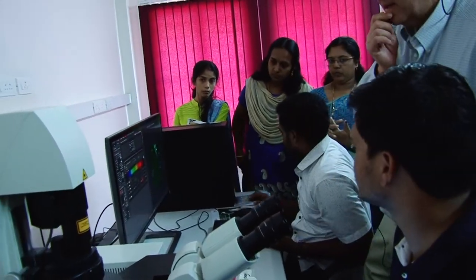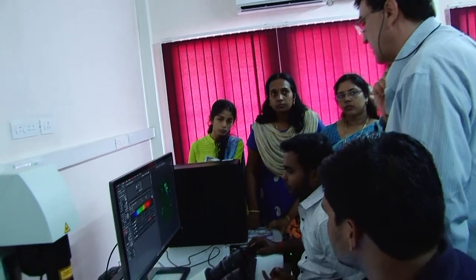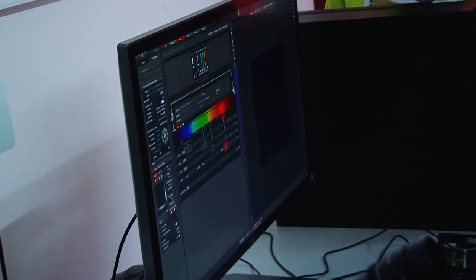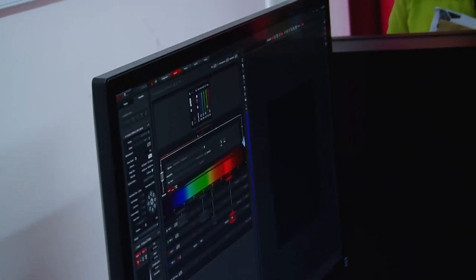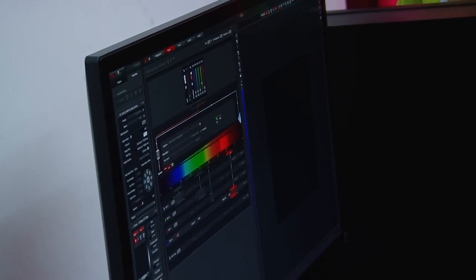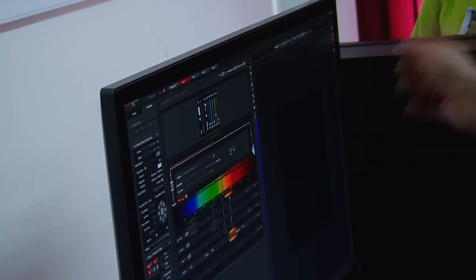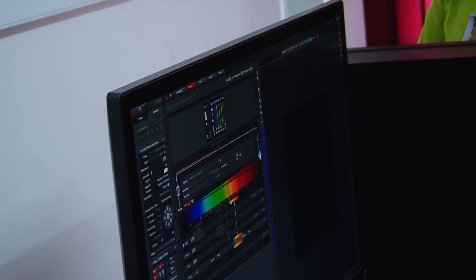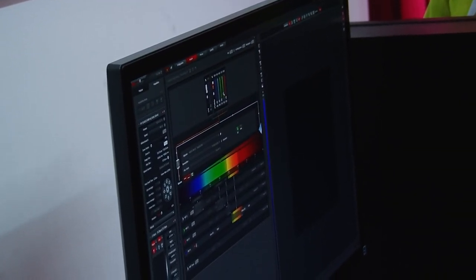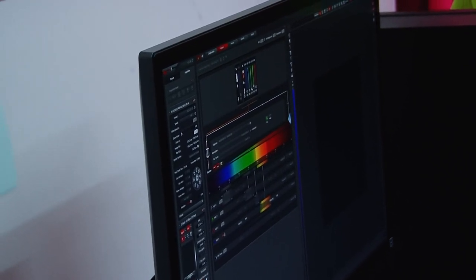Okay, so let's take a look at this live on the confocal. This is an eye I brought with me that I think was stained with H&E. And yeah, okay, it's not a fluorescent stain, but usually go down more in here, like, yeah, down in here more. Okay, take a look, see if we got something. Now, do you see the eye in there? Yeah, I can see. Okay, you can't look now because the laser's going.